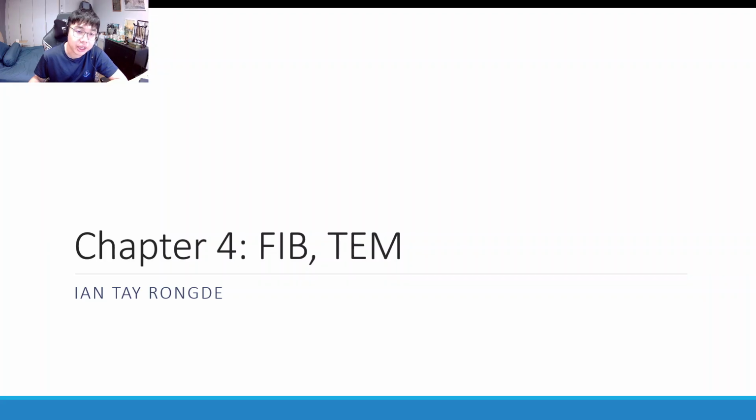So today I'll be talking about the focused ion beam technique as well as transmission electron microscopy, commonly abbreviated as TEM. My microphone is a bit funny, so I hope that this recording will turn out okay. So let's dive right in.